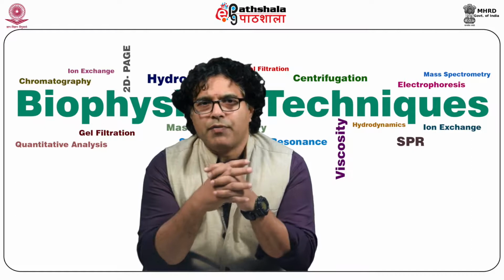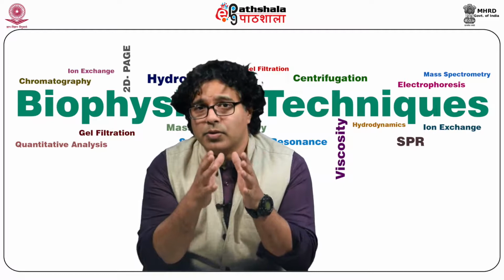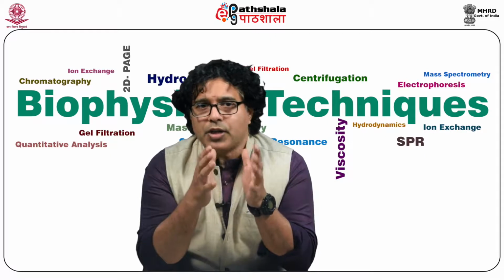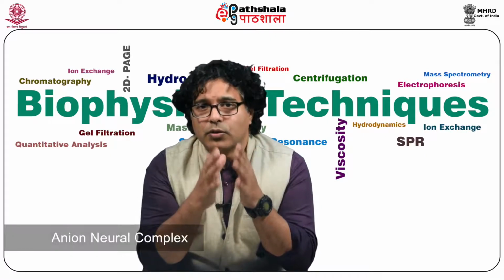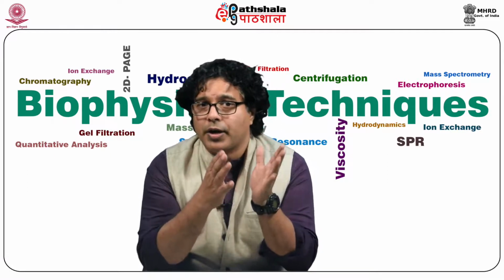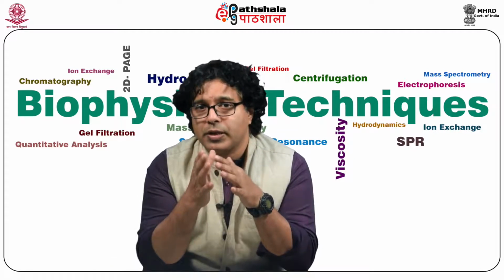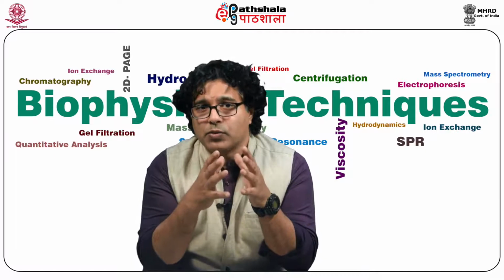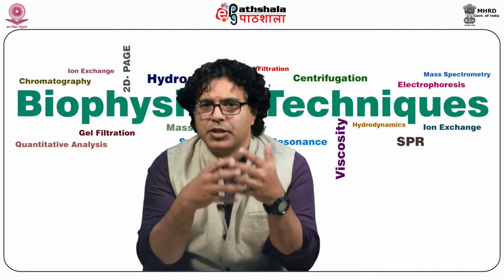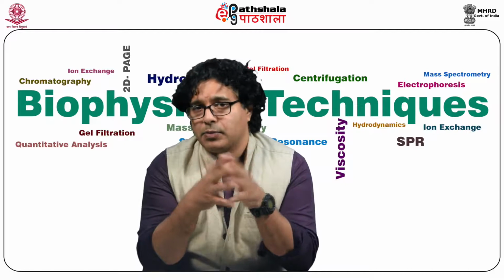In the anions, he found simple homolytic cleavage reactions where loss of a radical forms a stable radical anion. Initial formation of an anion neutral complex could then undergo a variety of reactions, which could be deprotonation or elimination reactions. Intermolecular proton transfer can lead to a new deprotonated species which fragments via an anion neutral complex. Rearrangement reactions sometimes lead to internal nucleophilic substitution or displacement and skeletal rearrangement reactions.